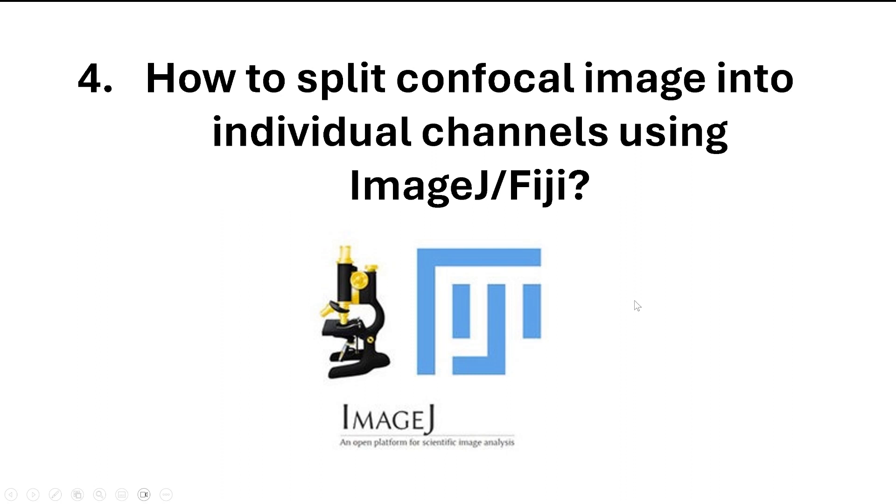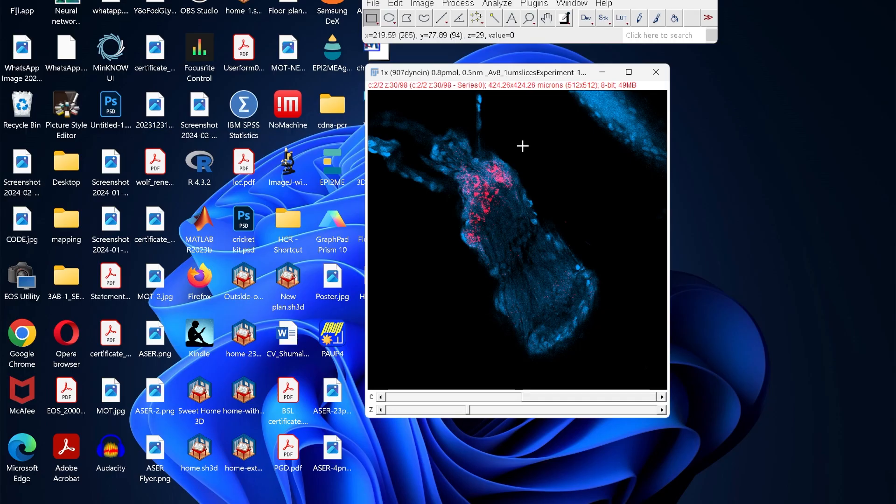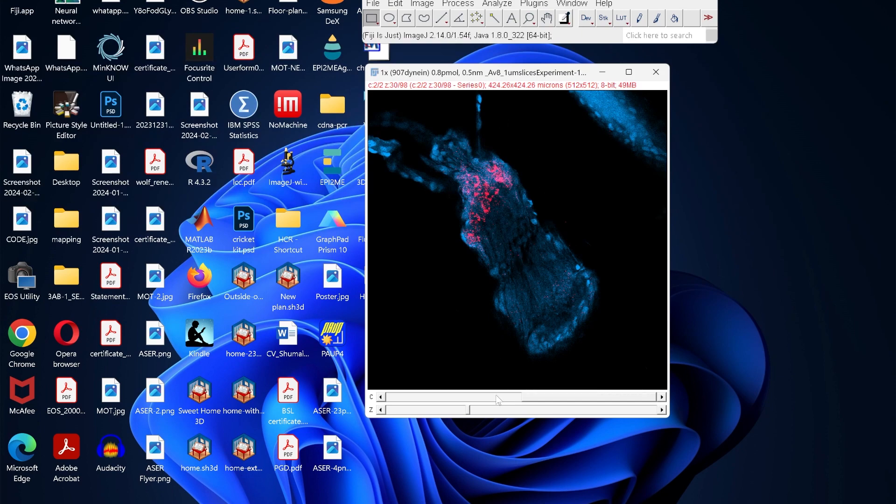How to split confocal image into individual channels using ImageJ or Fiji. Fluorescent confocal images are usually made of different channels.